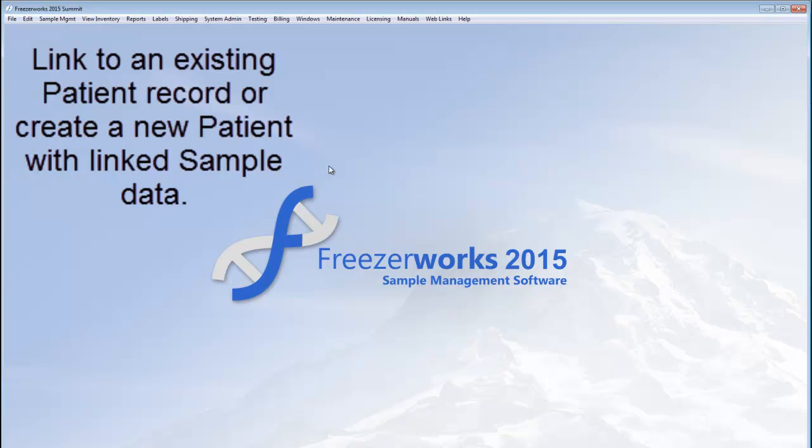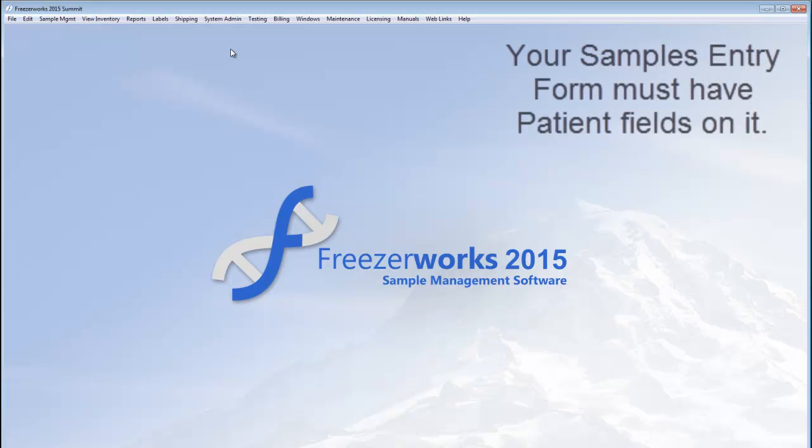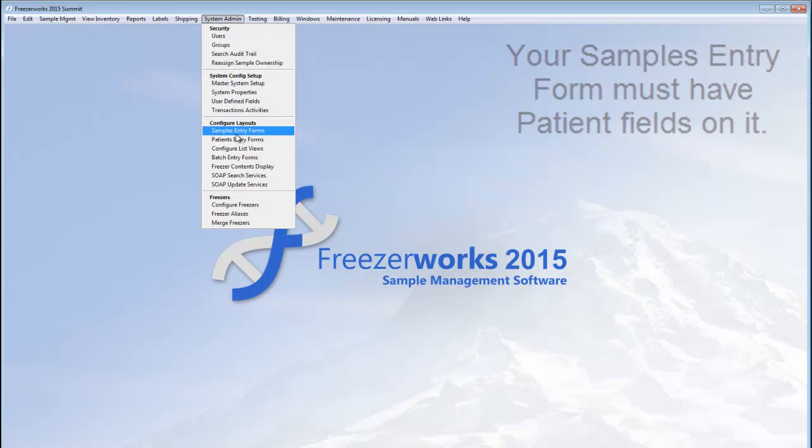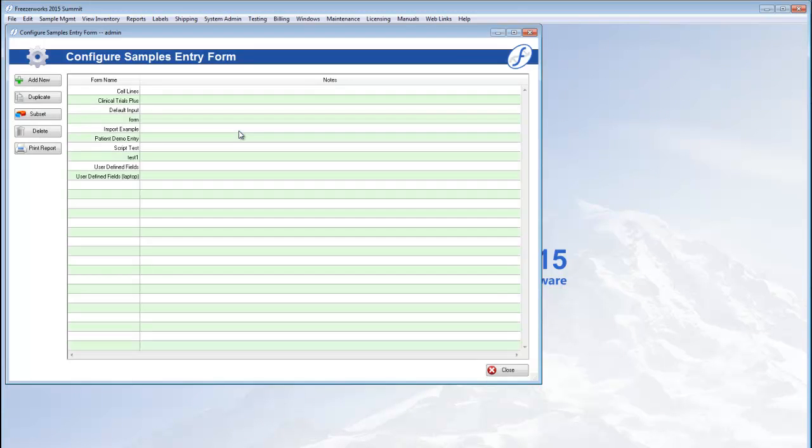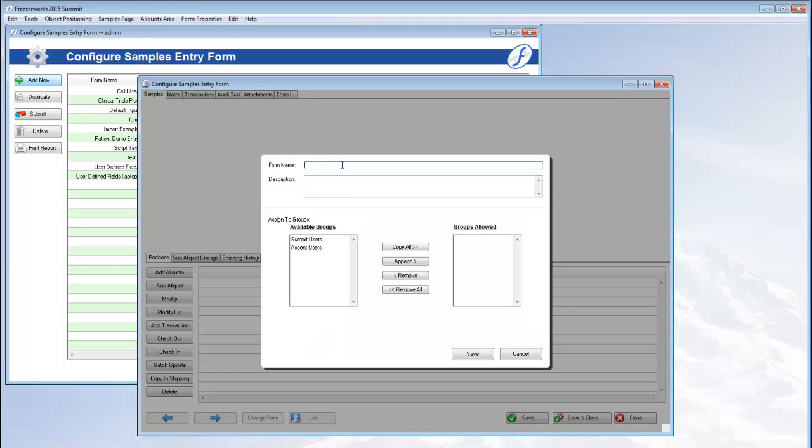This is done inside new or existing sample records. So first you must ensure that your samples entry form of choice contains patient fields. To do this, go to System Admin Samples Entry Forms and either open an existing form or start from scratch. We're going to add a new one for this video.